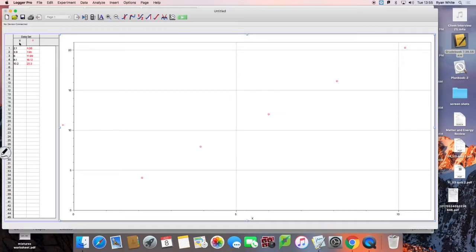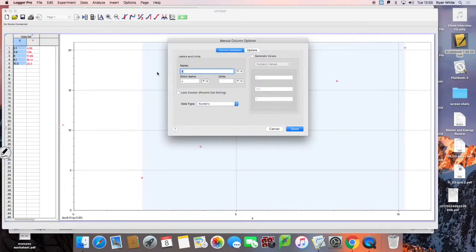X is going to be mass. If you want to change x and give it a name or a label, double click — that'll take you to the options menu and you can type in what the dimension is. So I'll put mass and then grams here.